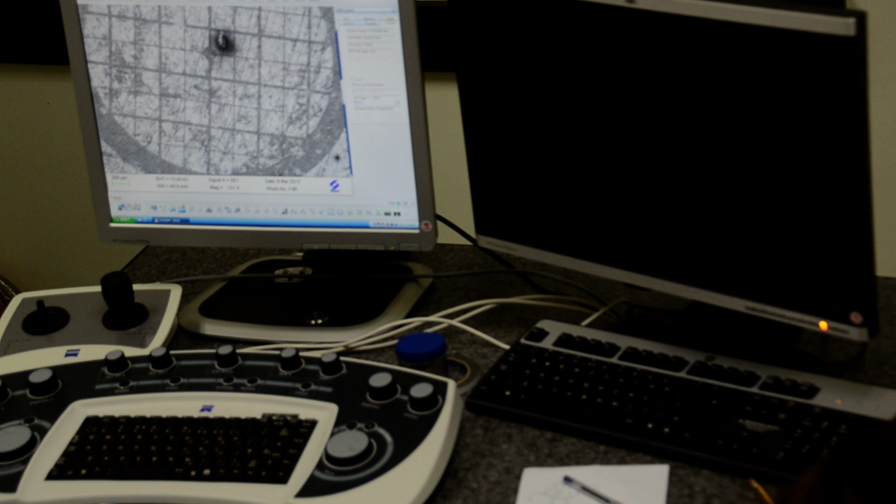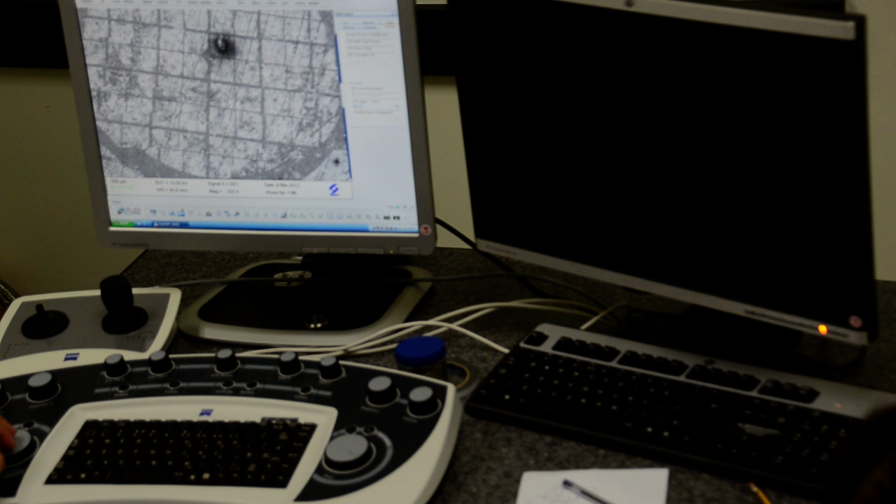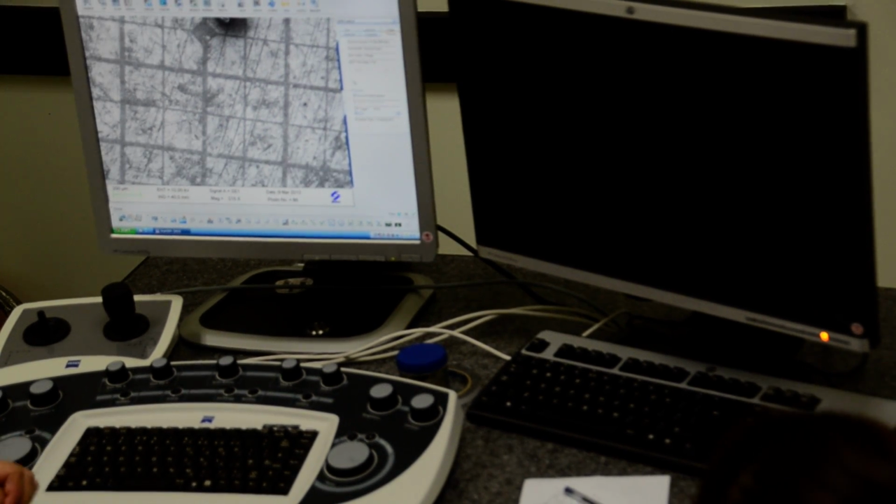No need to shop for special ones. Well, I mean, we're going to be using the full extent of the size of it. So we need much bigger sample holders. Yeah.